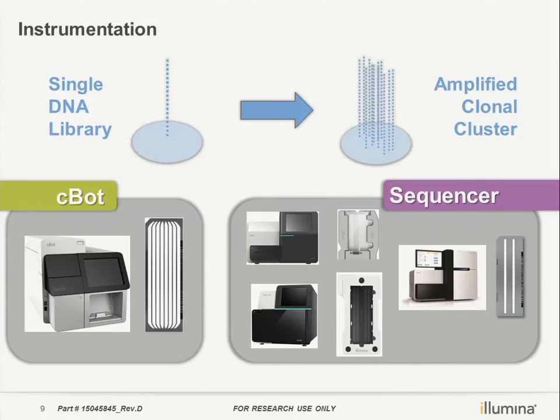Okay. But unlike HiSeq, for the HiSeq flow cell we have 8 lanes, and we can have individual samples cluster on individual lanes. But for NextSeq, even though we have 4 lanes, since the samples are evenly distributed, you must index your samples before loading. So in case I want to multiplex my samples, I need to add an index, rather than separating each sample into each lane as in HiSeq. Yeah, correct.